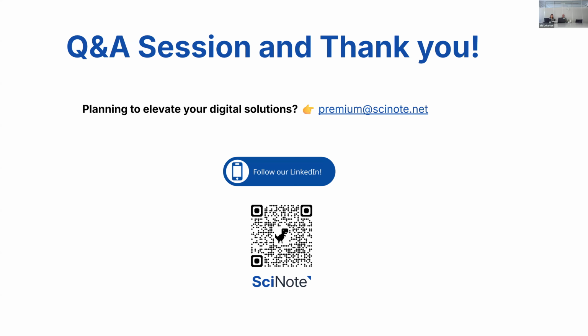So I also need to wrap my head around it. So you're doing aliquots, and then you want to make sure. Just to make sure I understood correctly, and Blaszka, please jump in. You're going to be executing a certain SOP where you get aliquots from a bulk material, you would do this on the task. So you would execute an SOP and then deduct the numbers from the inventory.